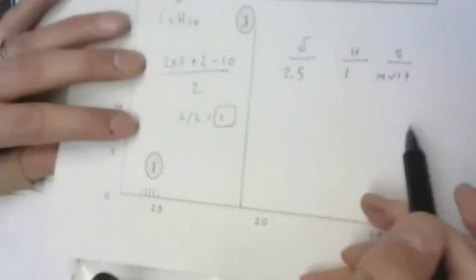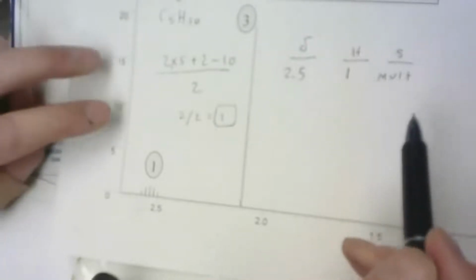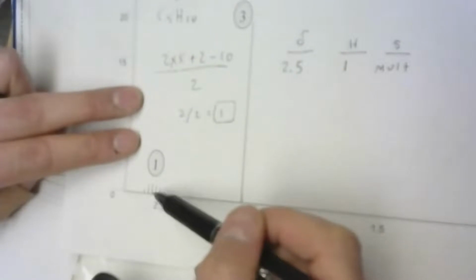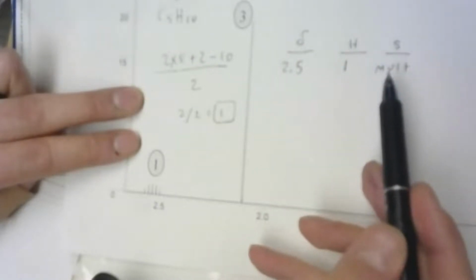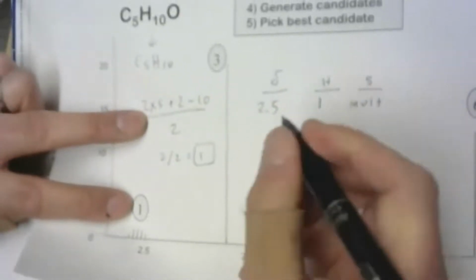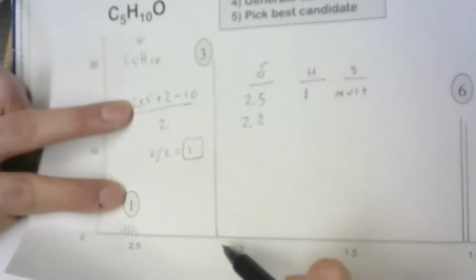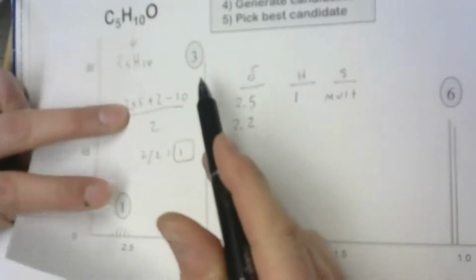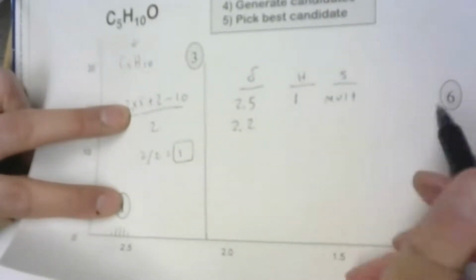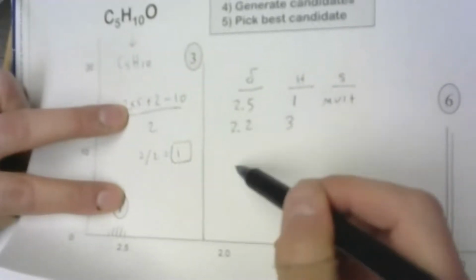Mult can be interpreted as a bunch of neighbors, and the N+1 rule is neighbors plus 1. This is obviously something with a bunch of stuff around it. Mult, I just assume to be the same thing. Okay, what is 2.2? How many protons? Probably 3. Somebody said CH3, but that's stepping ahead a bit, and I'm trying to do this sequentially.